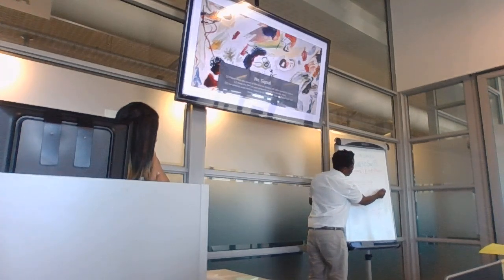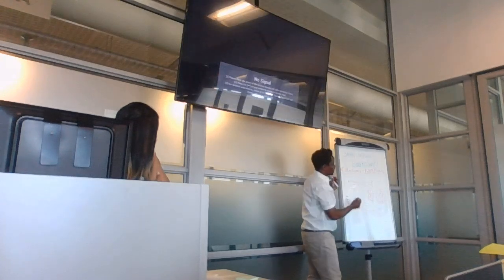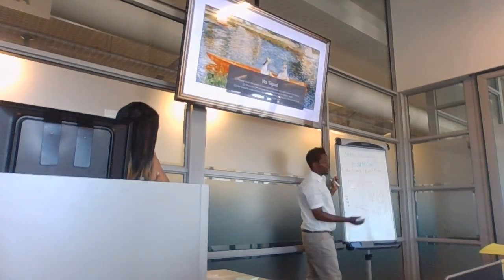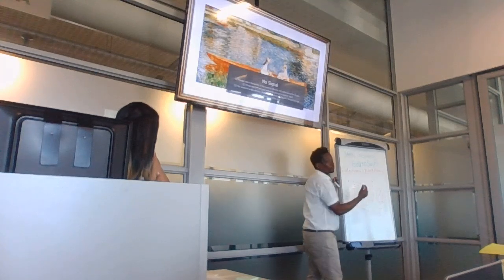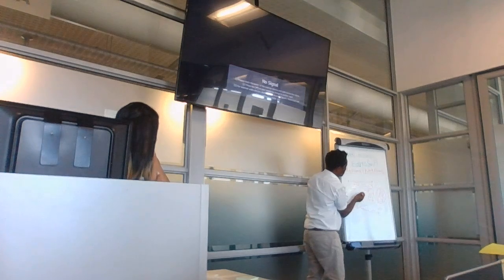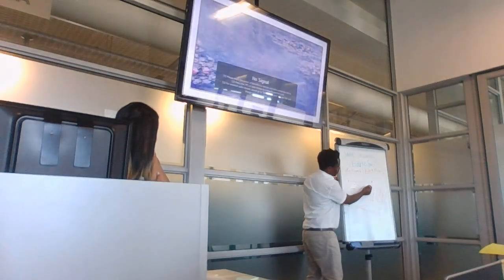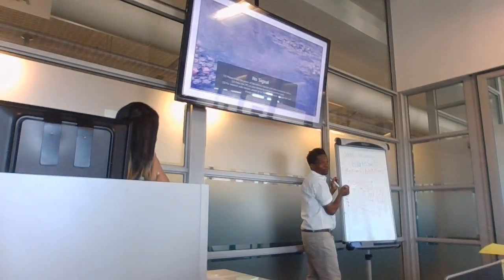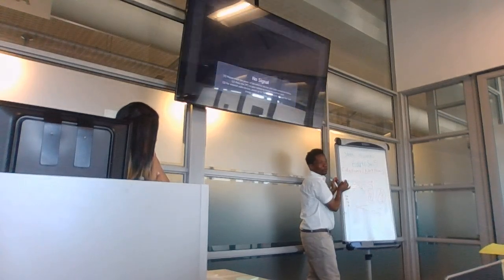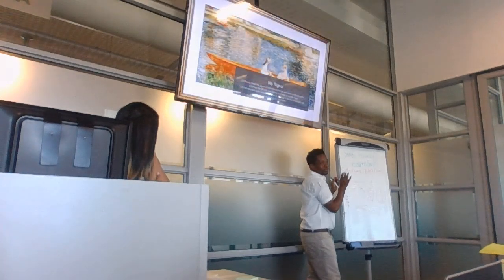If we do it with this file alone, it's not sufficient to give us all the information we need. If we do it with this one only, it's also not sufficient. Because it goes back to our original segments, if we can assemble them, we get the whole. Is it clear now?